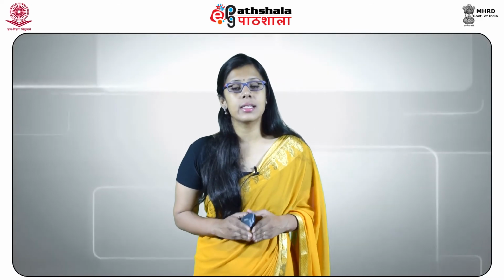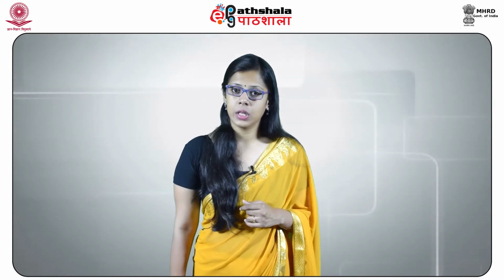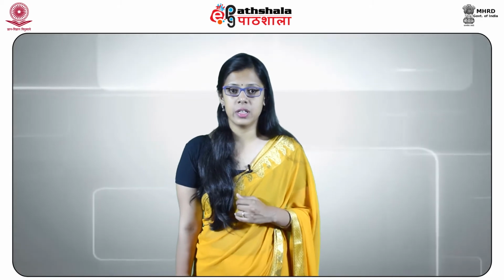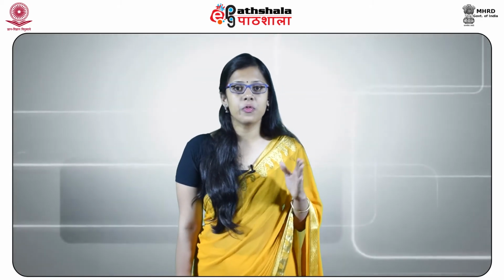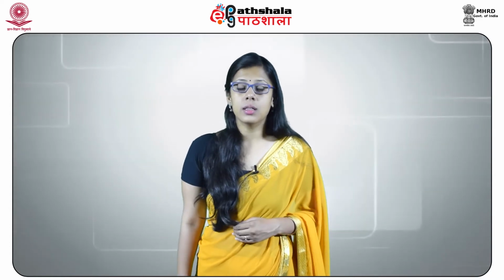The scanning electron microscope, popularly known as SEM, is used for observation of specimen surfaces. When the specimen is irradiated with a fine electron beam, secondary electrons are emitted from the specimen surface. The topography of the surface can be observed by two-dimensional scanning of the electron beam over the surface and acquisition of an image from the detected secondary electrons.